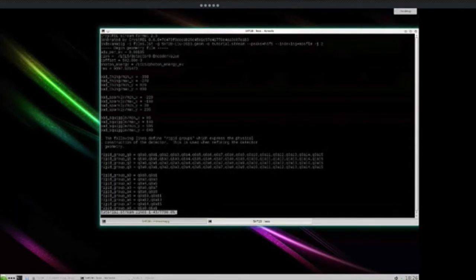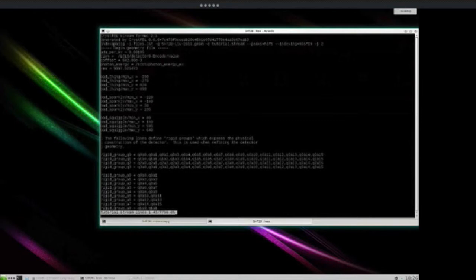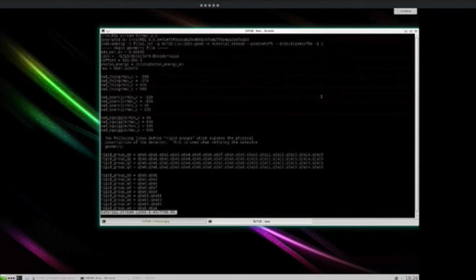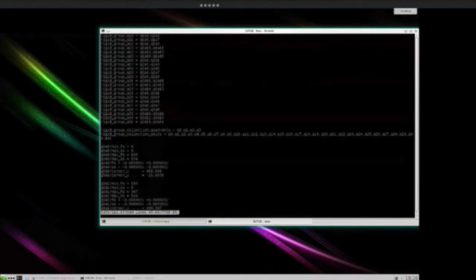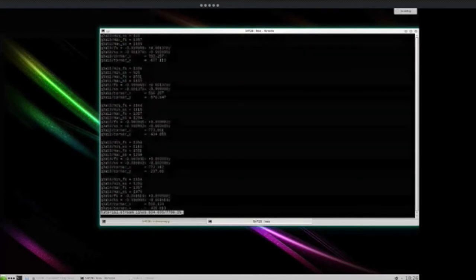It starts with a record of the version number of CrystFEL that generated this stream. So you have a record of what version you used. There's also the command line that you used to create that, so that's recorded as well. And it's followed by the geometry file. This is the geometry file you gave, just included verbatim. The idea is that you have as complete a record as possible of what you did, so you can reproduce it.